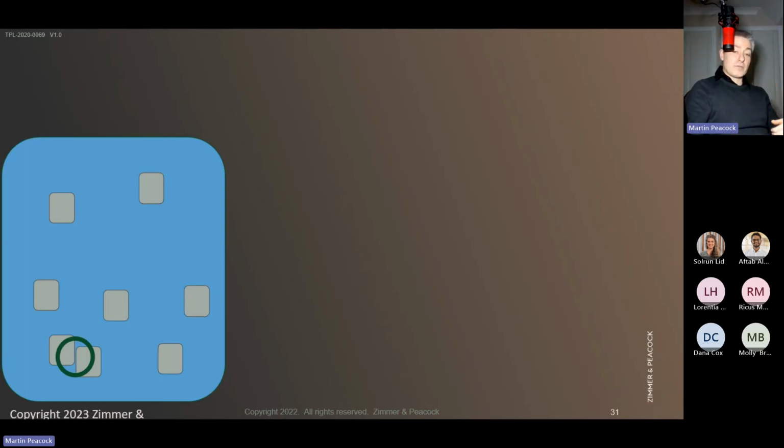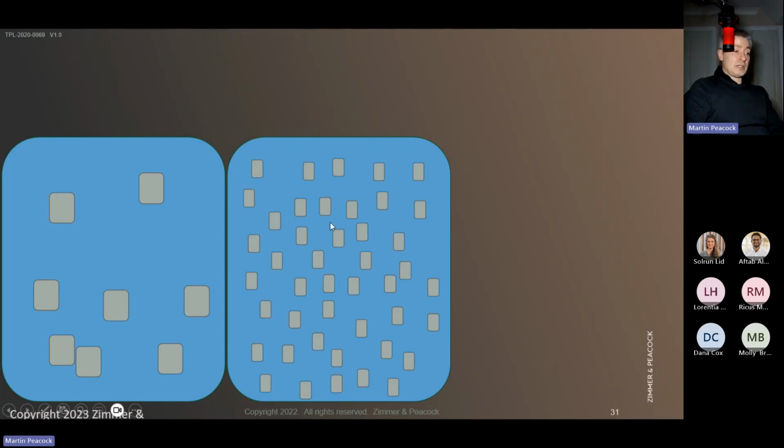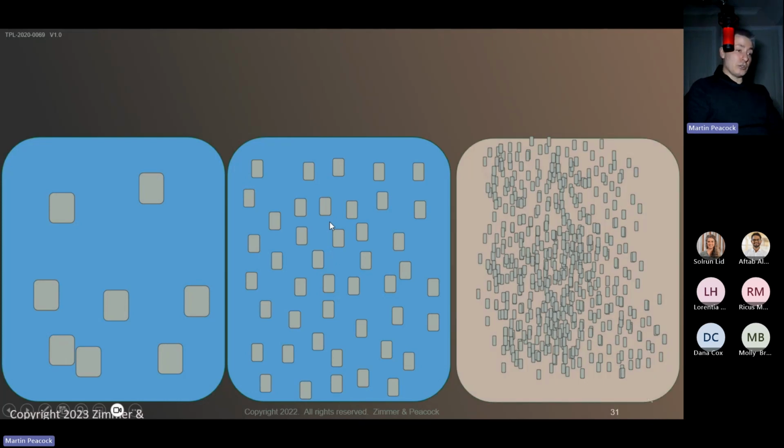You could just take a sample from a very high capsaicin concentration or from a very low capsaicin concentration. If you take something that's more homogeneous, I've broken up the capsaicin a little bit here. Every time we take a sample, we are capturing capsaicin, but we're capturing different amounts of capsaicin. But if we take something that's very homogeneous, then when we sample here, we're always capturing capsaicin, and that's much easier to sample.